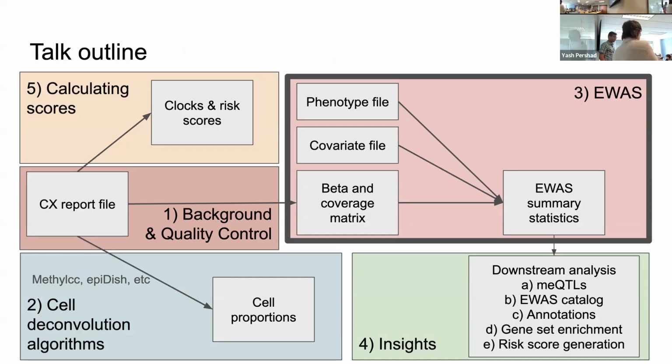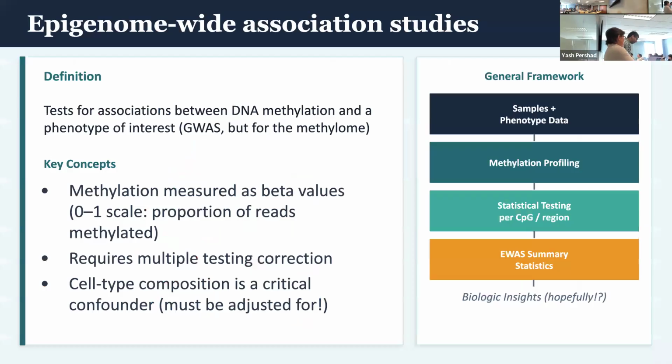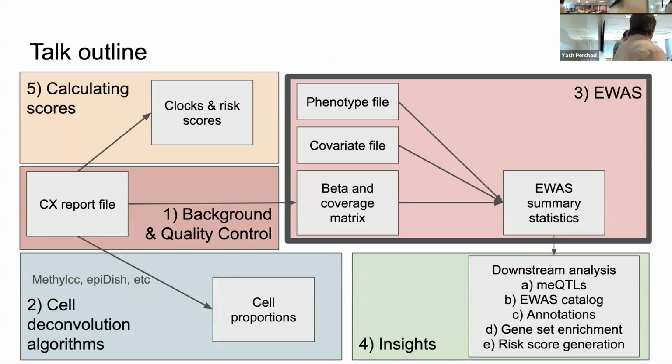All right. Everyone's waiting for the EWAS part. So this is now going to be your EWAS section. There should be an arrow connecting cell proportions to EWAS, sorry. And we can dive in.